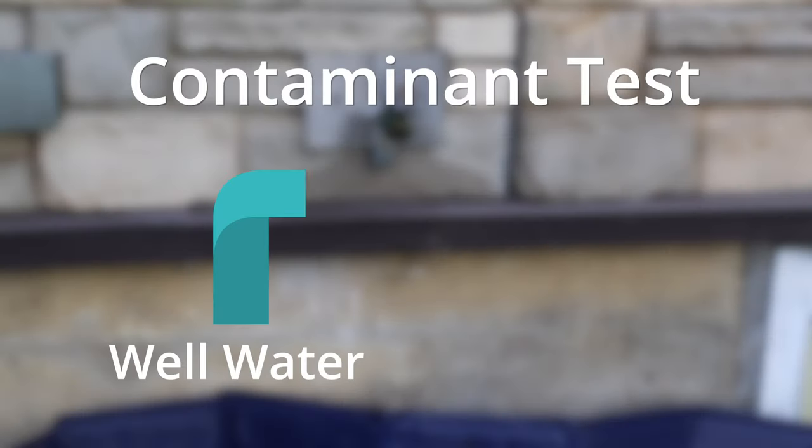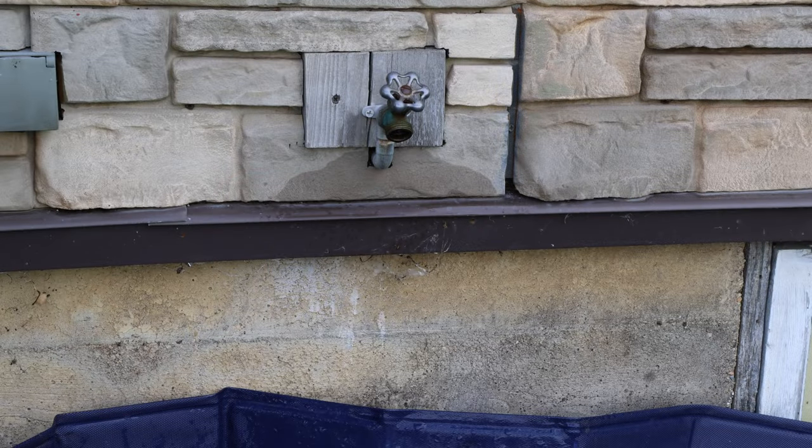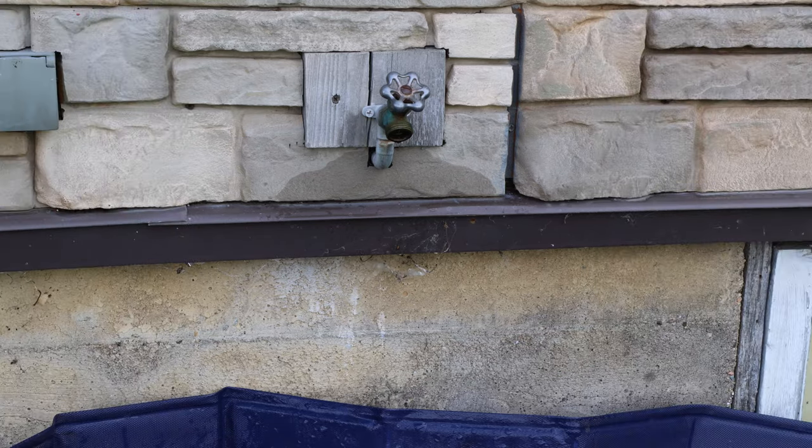For my contaminant test, I'll locate a tap that gets well water without any treatment. Ideally, this would be a tap directly from my well, but since my old well makes this difficult, I know that my outside tap can fit this need.